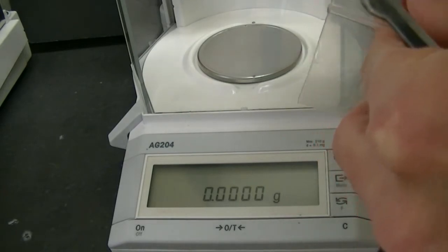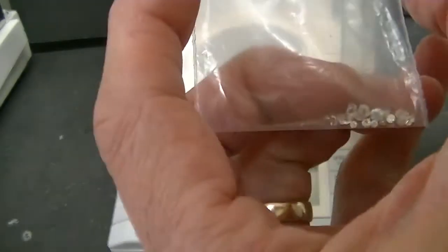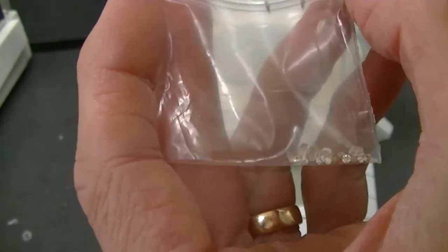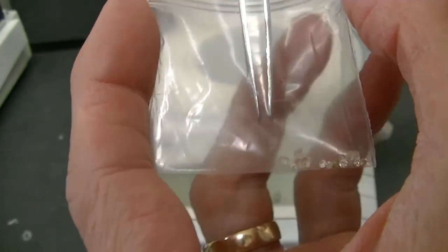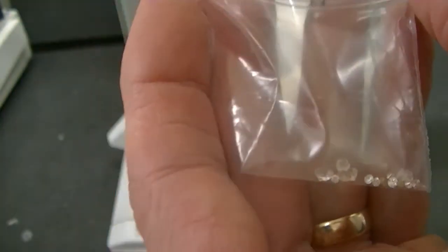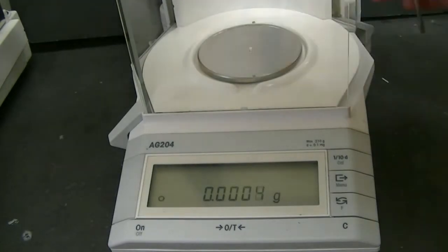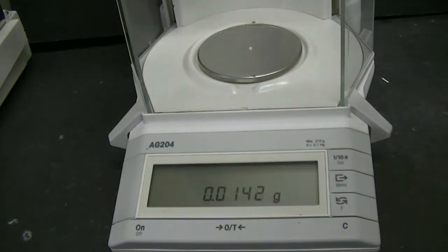Alright, let's open up the bag and choose one of the diamonds for our experiments. I think I'm going to pick this one right here. Wow, it actually looks quite beautiful. Alright, let's find out how much the diamond weighs. Place it on the scale — it looks like it's about 0.0146 grams. That's about 14.6 milligrams.